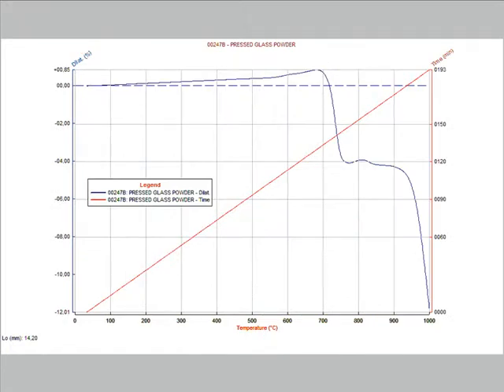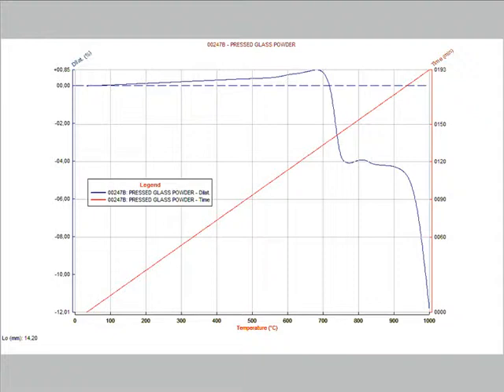This is a curve recorded on a sample of pressed powder of glass. The test continued up to the melting of the sample. We can clearly see that the material expanded up to 640 degrees and then it shrunk up to 4%. After that, it stays fairly stable up to 900 degrees and above this temperature it starts collapsing. The test was ended when the temperature reached 1000 degrees and the shrinkage overcame 12%.